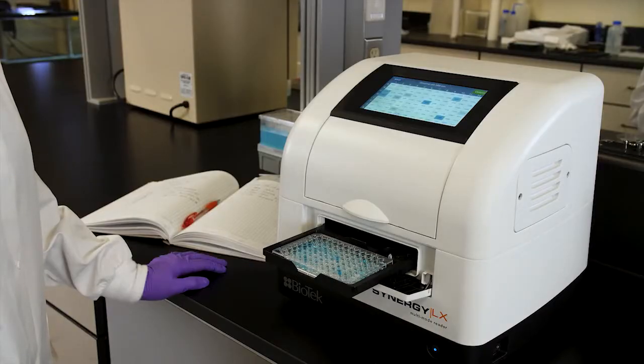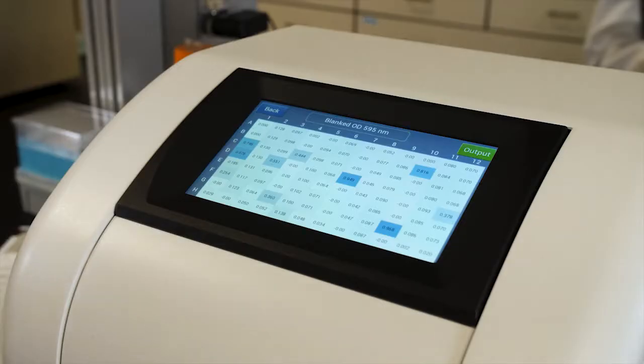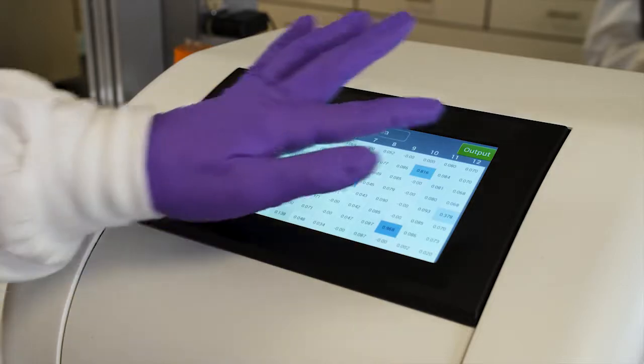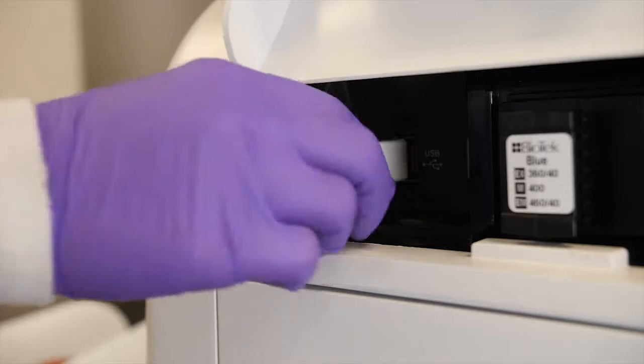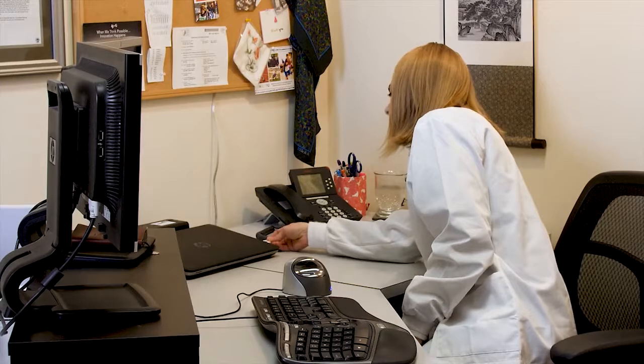Review data directly on the display. The color gradient helps visualize the data range. With one touch, export data to a USB stick for analysis in Biotek's Gen5 software or in a spreadsheet application.